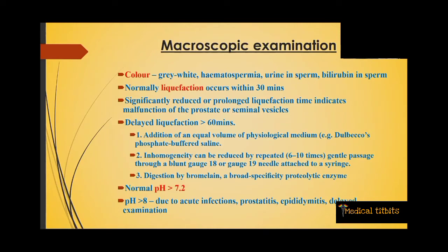And the pH, which is normally more than 7.2, can be increased due to acute infections, especially those affecting the prostate or epididymis, or due to delayed examination.